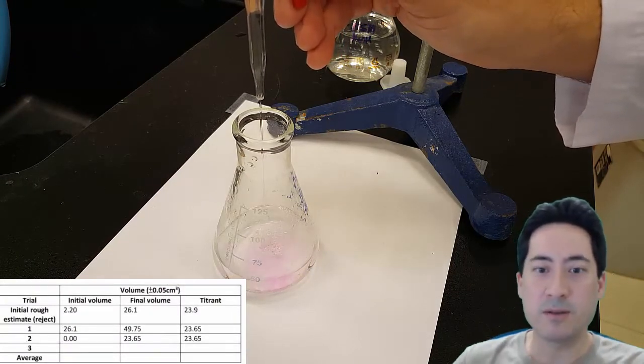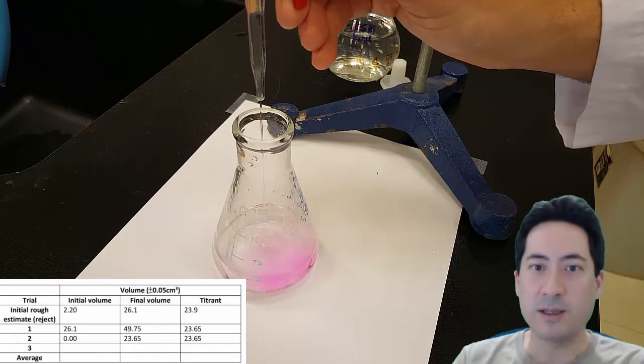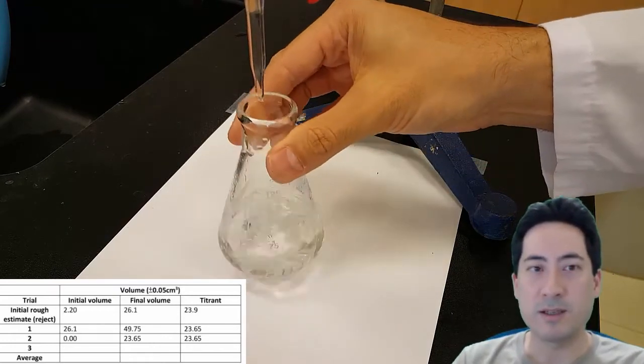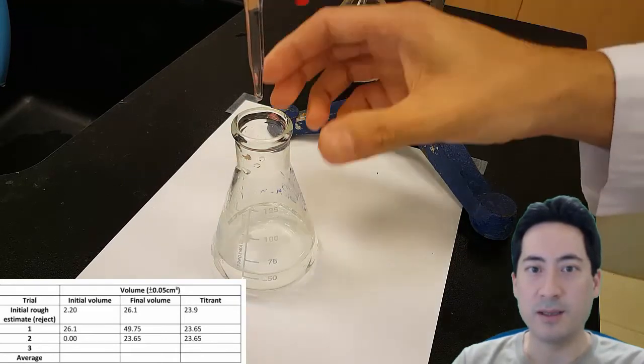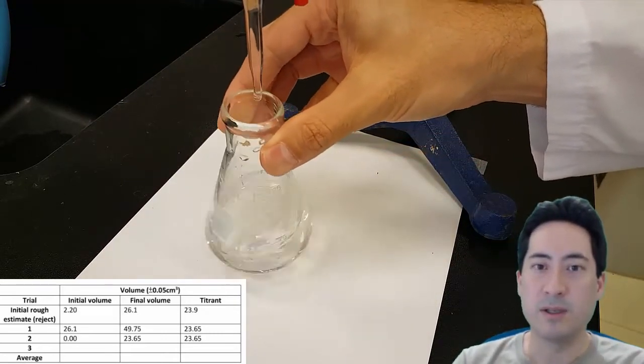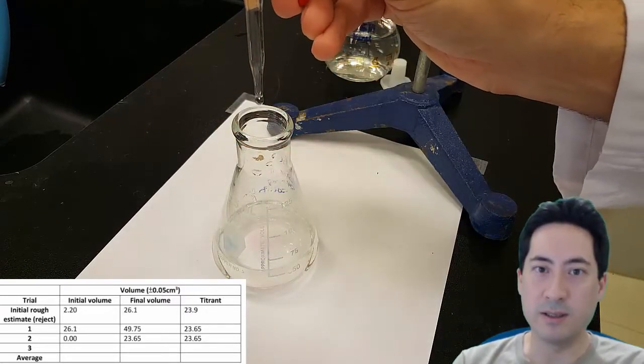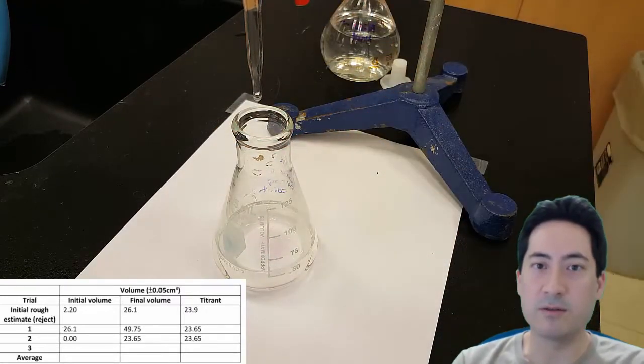And so now I'm ready to do my first trial. I can pretty much go straight away, go down to like 22 or 23. And so that's what I've done here. And then once I get to 22, I'm going to really start going slowly because I need to see what it is down to the single drop.